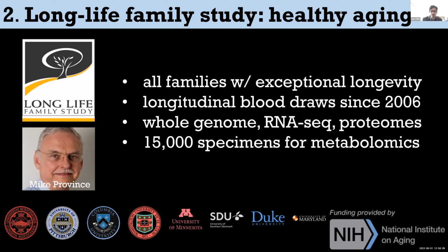On these participants, they're collecting a lot of different omics information. They're doing whole genome sequencing, RNA sequencing, proteomics, and we are contributing the metabolomics. It's unique, at least for us, in that the amount of samples that we're analyzing is higher than the other experiments that we've performed in lab. So we're looking at about 15,000 different samples for metabolomics analysis.